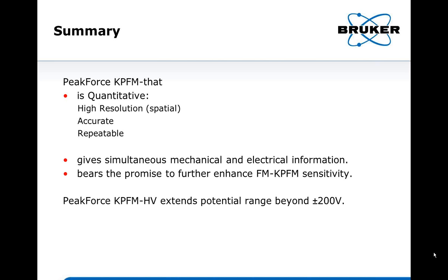I recall quite a bit earlier there was a question: do you furnish a reference sample with the KPFM package? For that one, I would say yes. With the KPFM package, we have a sample to go with it that you can use as a standard. Basically, it has aluminum, gold, and also silicon. The gold is more stable in ambient, so that can serve as a calibration standard.